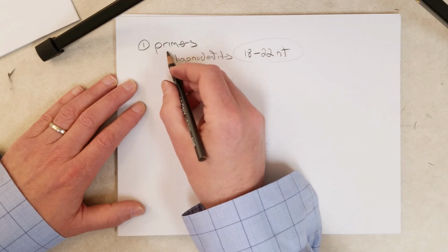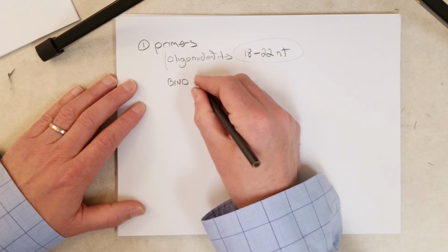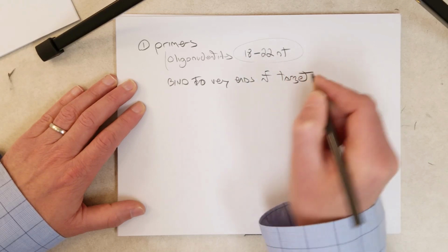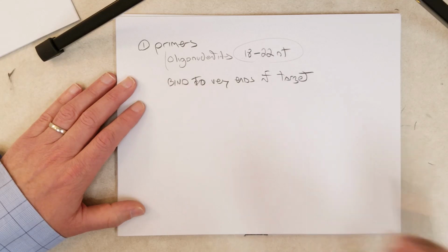It's also important for the primers to bind to the very ends of the target sequence. So you have to design your primers and choose the sequence of the primers so they stick to either side of the target sequence. So let me see if I can find.